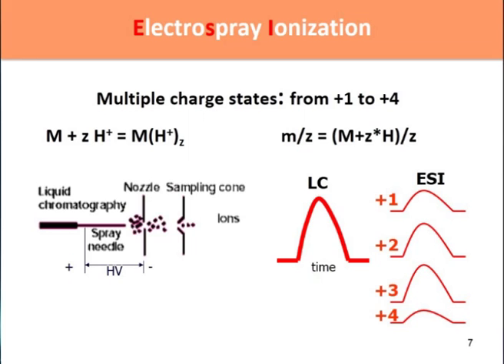But this one peak is a little misleading, because that's what's coming out of the column. When you ionize that eluting peptide, it could actually take multiple charge states. In this case, we're saying 1 to 4. It could be more. Sometimes we get enough charge state 5. So even though there is only one elution peak, that could create in your MS1 map different amounts of different chromatographic peaks at different charge states. And obviously the size of each will depend on what ionization state is more preferred or more likely to happen for this one peptide.